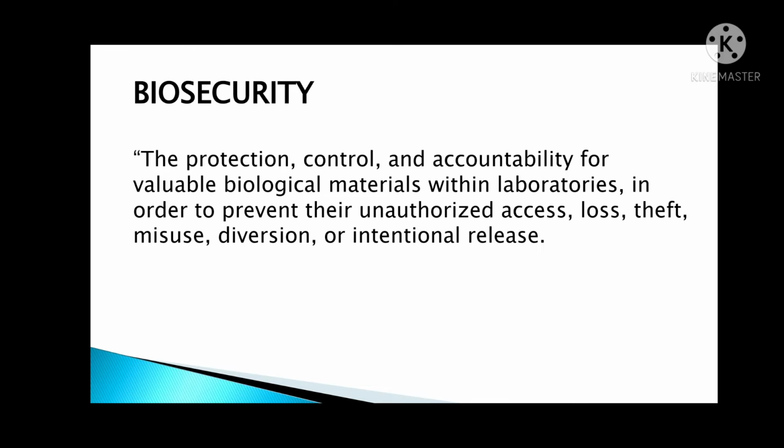While the term biosecurity means the protection, control, and accountability for valuable biological materials within laboratories in order to prevent their unauthorized access, loss, theft, misuse, diversion, or intentional release. Let us define it again in simpler terms so that it will sound easy for you, class.